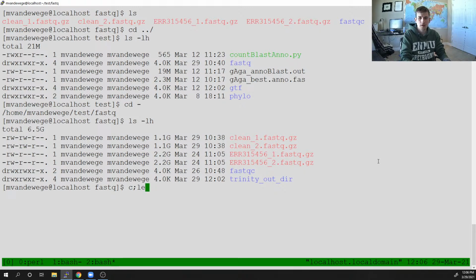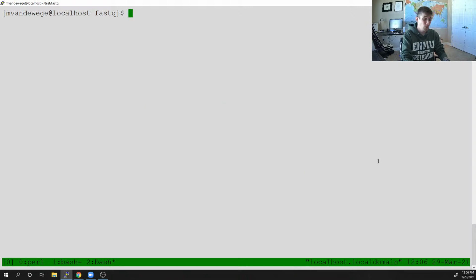All right. Since that's running, today's probably going to be pretty short. All I'm going to do is demonstrate how to run this line, and it does take a while. So far, I'm just using 6 processors. It's going to take a little while, so definitely make sure you run this in a tmux shell. Otherwise, you run the risk of a network disconnecting before your job finishes.